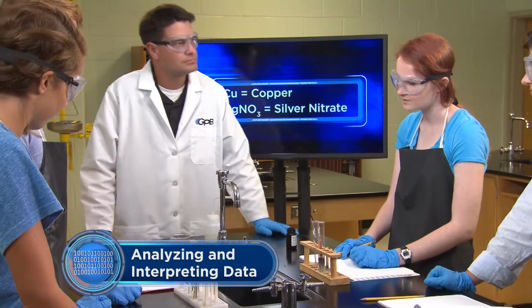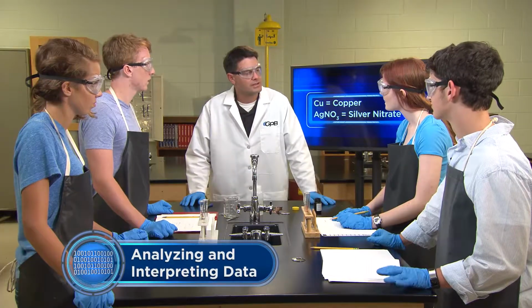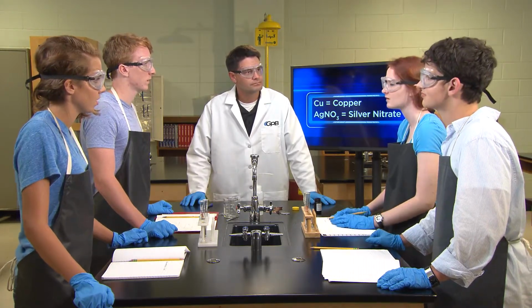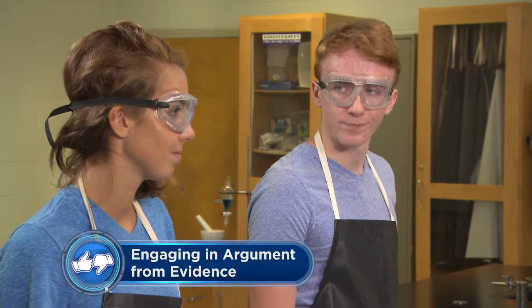Well, it's grayish, so is it silver? That's a good hypothesis. How did you come up with that? Well, it's not copper because it's the wrong color. And nitrogen and oxygen are gases, so that only leaves silver. Plus, I know silver doesn't dissolve in water, or silver rings would fall off whenever we wash our hands. Great evidence from both this lab and from your own life. And you're right, silver is forming.